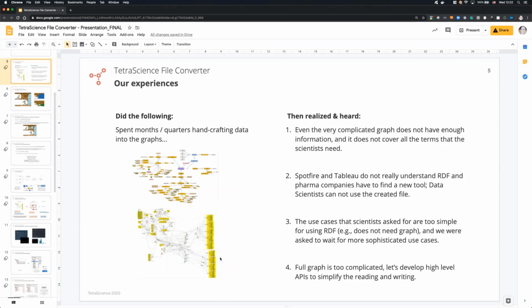I'll just close with the fact that it was enlightening to me when we got into this, not being an analytical chemist by training, to learn that the applications that run the instruments and capture the data generally have a relational database underneath the application. Why is that? Because it's complicated and there's a lot of things to keep track of and a lot of relationships.